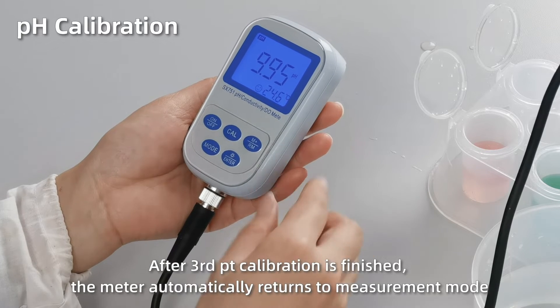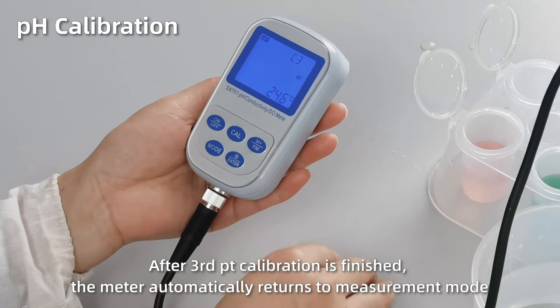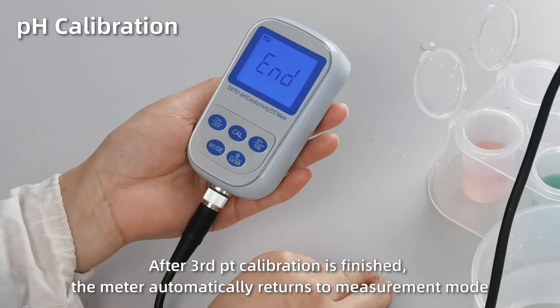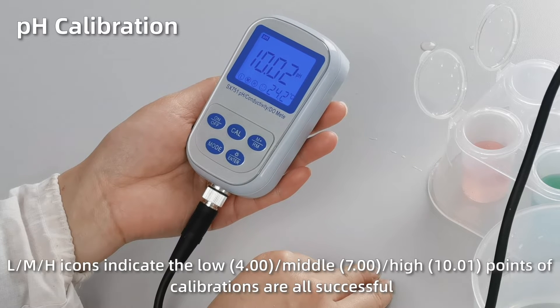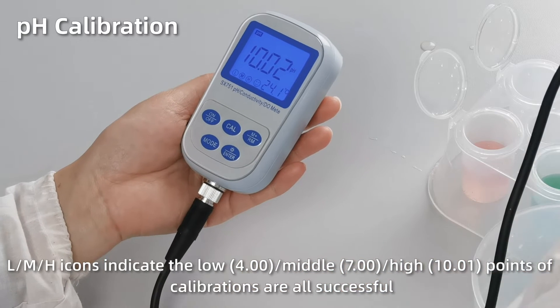After it's finished, the meter automatically returns to measurement mode. The L, M, H icons at the bottom left indicate the three points of calibrations are all successful.